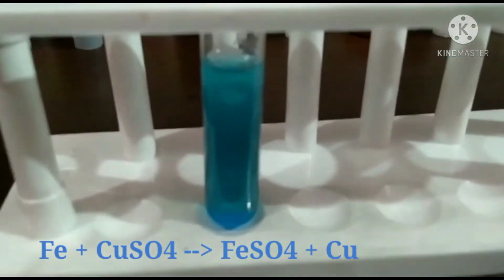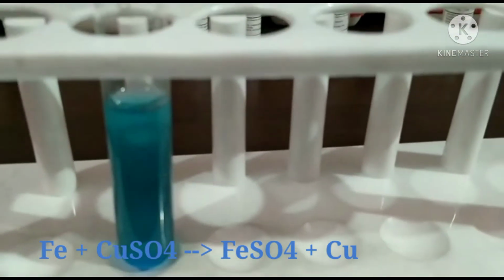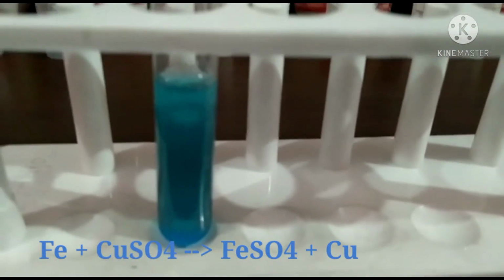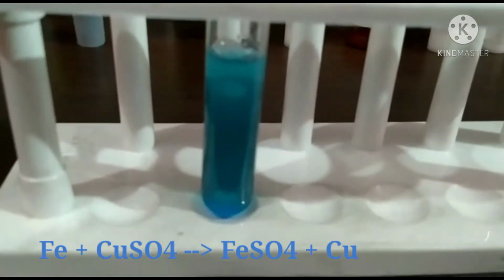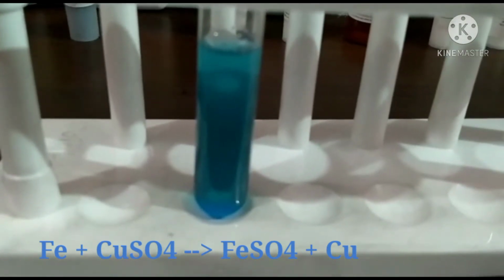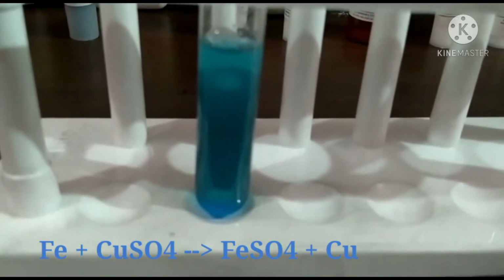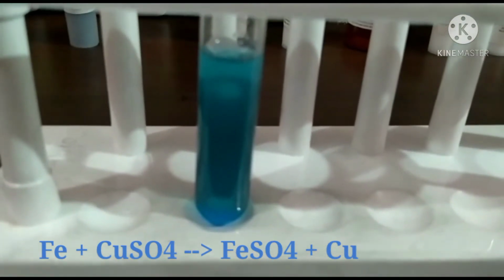After some time you will observe that the blue color solution changes to light green due to the formation of iron sulfate in the solution, and the silver color iron will turn reddish brown due to the formation of copper.